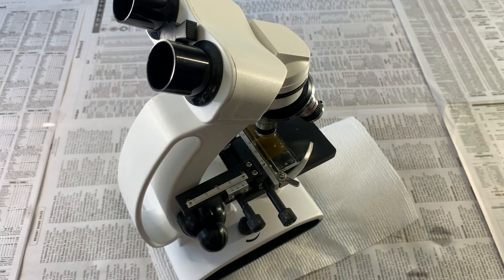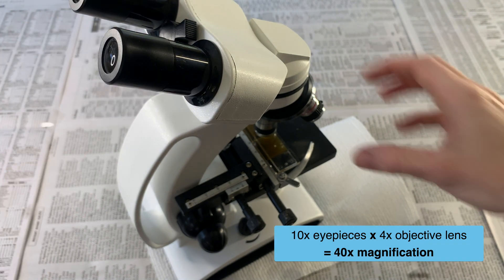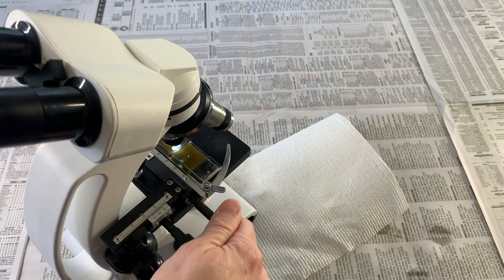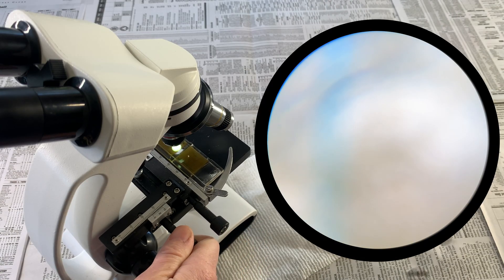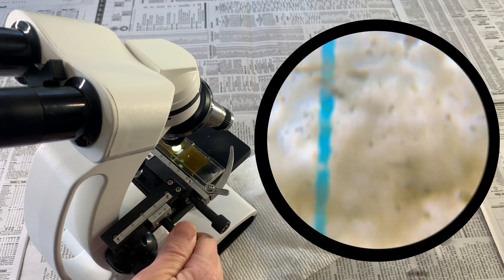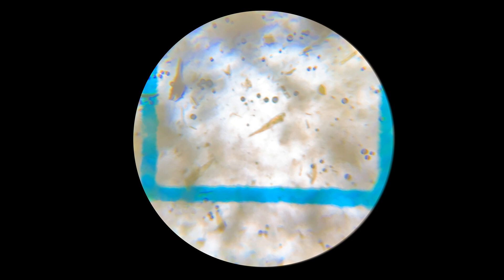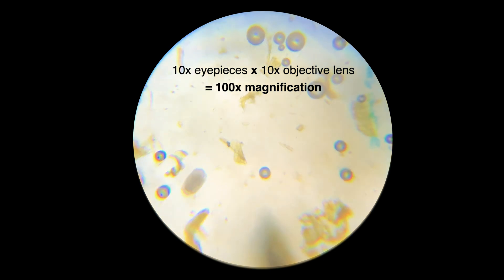To begin, set your microscope up with the 10x eyepieces and rotate to the 4x objective lens. Looking through your scope, move the stage around and locate the blue lines of the slide as a starting point. Use the focus dials on your microscope to bring these lines into focus. Note that everything you're seeing is inverted, so the direction you move the stage is the opposite of what you're seeing. For a more detailed view, you can switch to the 10x objective lens and refocus on your sample.